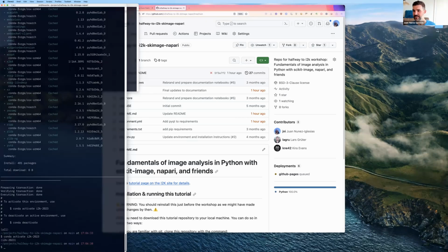Okay, so welcome. As I sort of tried to say in the little post about the workshop, this is for people who have a little bit of experience with Python and Jupyter notebooks and so on. If you don't, feel free to stick around and see what you can pick up. We are always happy to help you on the Zulip, but it might move a bit fast for you if you haven't got experience with Python before.